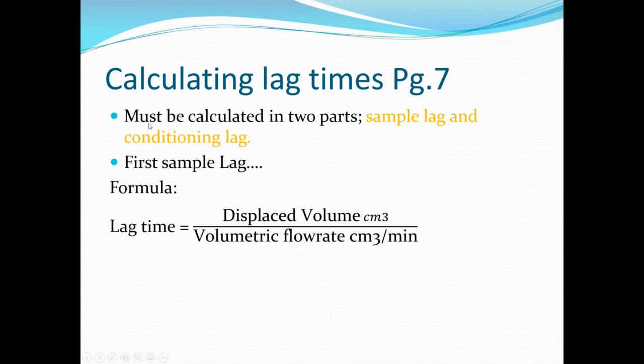When we're calculating lag times, we have to calculate the two parts. The first part is the sample lag, which, again, we talked about, involves the sample transport portion of the analyzer system, and then the conditioning lag, which is that chunk of hardware that sets the sample up to be appropriate for the analyzer. So it's math, but it's not terribly crazy math.